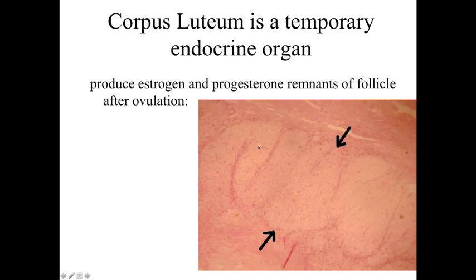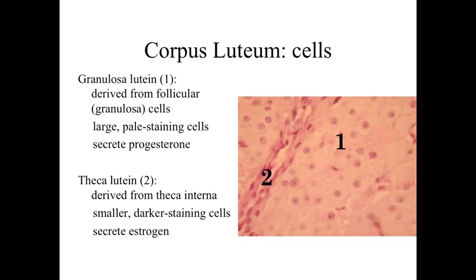After ovulation, what's left behind are the follicular cells and theca cells, which give rise to the corpus luteum — a temporary endocrine structure with a woven, twisted appearance involved with the production of estrogen and progesterone. At higher magnification, we can see the granulosa lutein cells, derived from the granulosa or follicular cells, which are larger, paler-staining cells involved with secretion of progesterone. The smaller, darker-staining cells are derived from the theca interna and are involved with the production and secretion of estrogen.